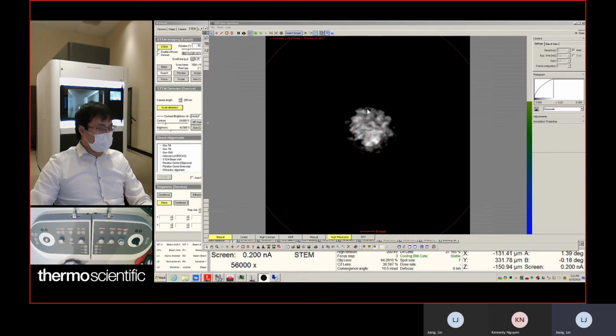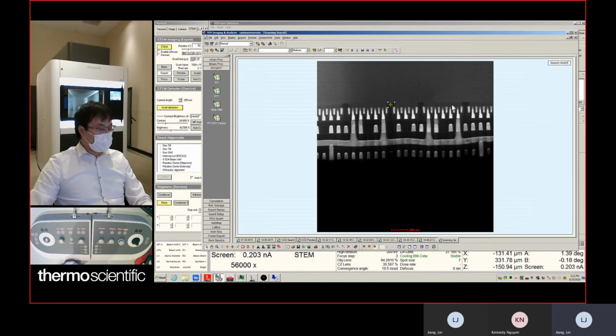You're going to zoom out, which gives you a better view of your central disk. So this is your Ronchigram right now. You can also use the central valve of your mouse to increase or decrease the contrast. So right now it seems we are on the crystal material. We can see the Kikuchi pattern. So I might want to choose a different location. I want to choose the amorphous region to do alignment.